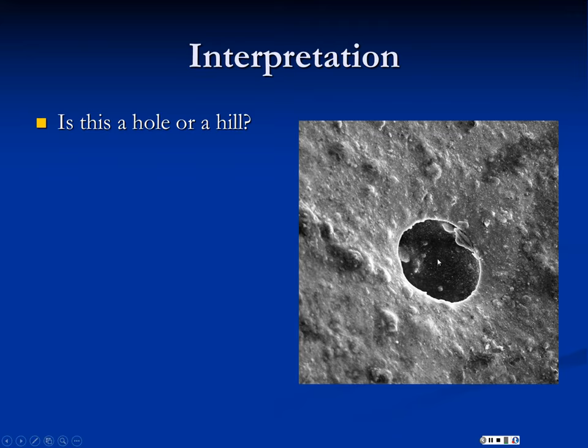But this is down in a hole, so fewer electrons are able to get out, so we're getting a darker return from a flat surface. Okay? So this is actually a bubble in paint on a button, one of those little buttons on your car radio. So we're looking in a broken bubble. And that's the layer of paint below the surface, or maybe the plastic underneath.